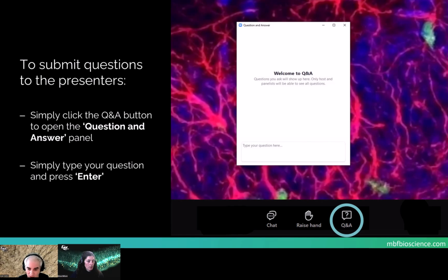And we cannot give an estimate, but we are really working on that right now. So probably in months we'll have something. But the one important thing is, if you are interested, people asking about providing data for, for example, NISO, please let us know. You have this information to contact us. Send those images, and we can do some training on those images.